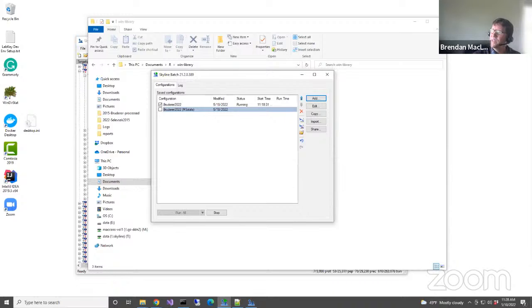When I tried using a raw file for editing the isolation scheme, I got the following: instrument index not available for requested device. So presumably this is not our raw file. This is your special raw file from your computer and from your instrument. So I would just say, that's great to post to the Skyline support board.